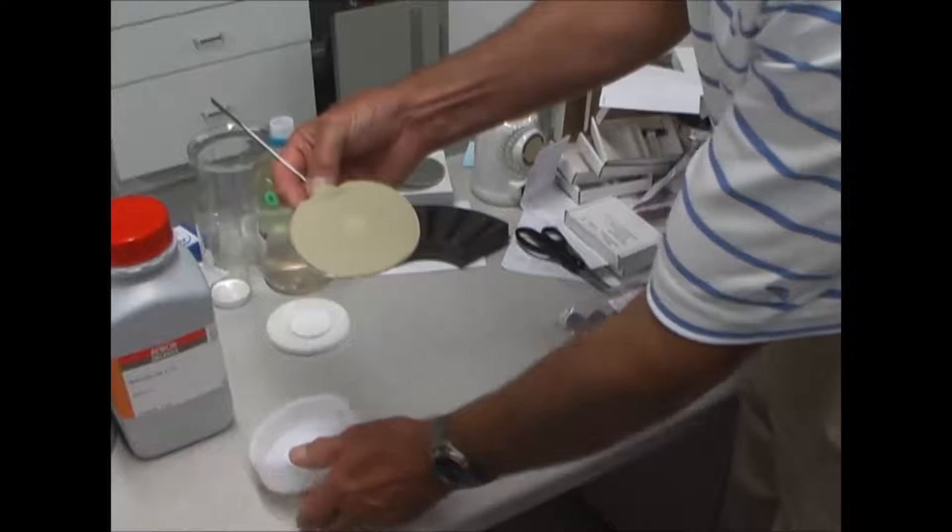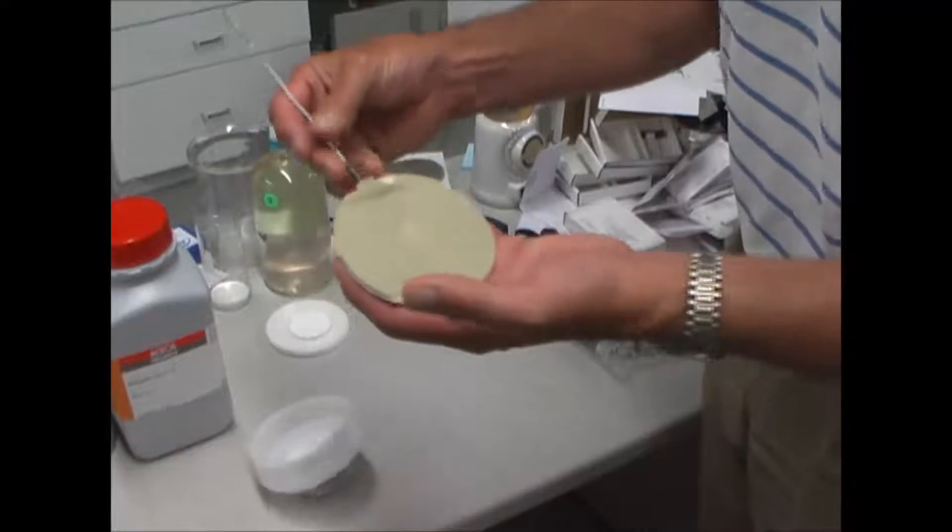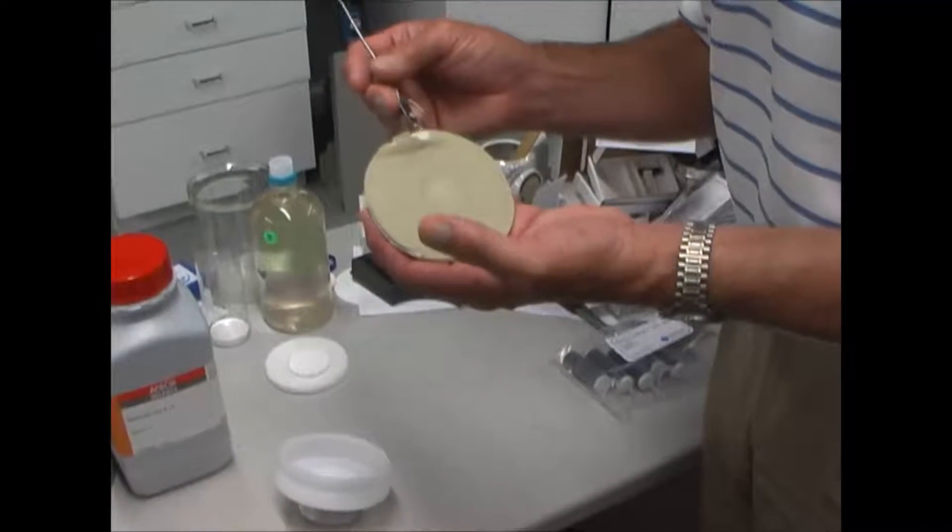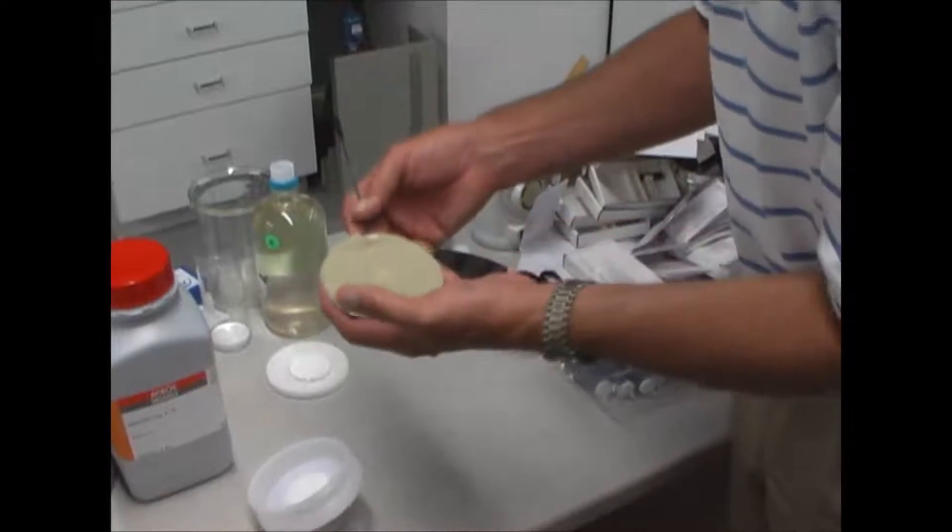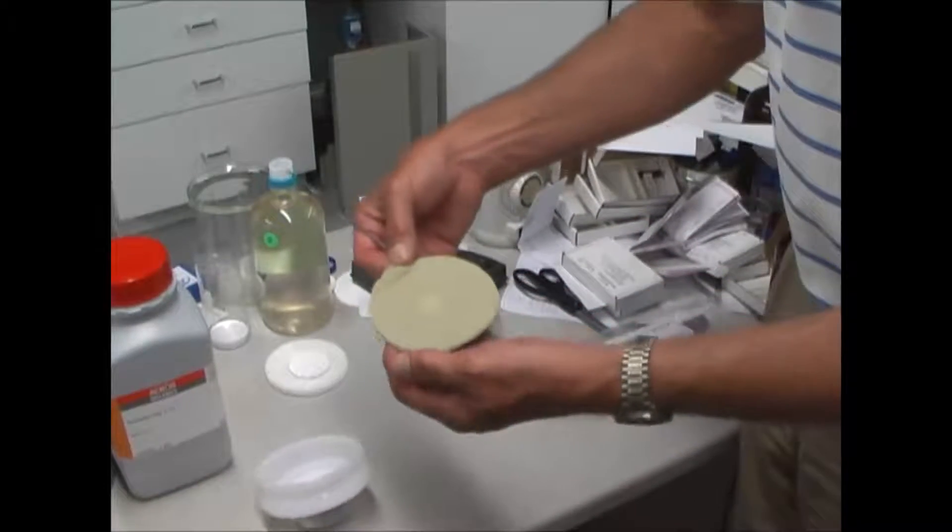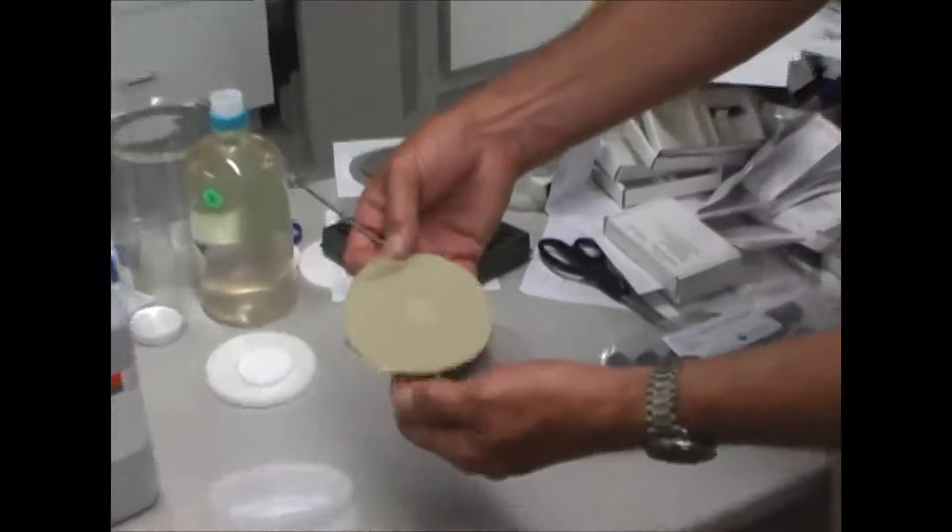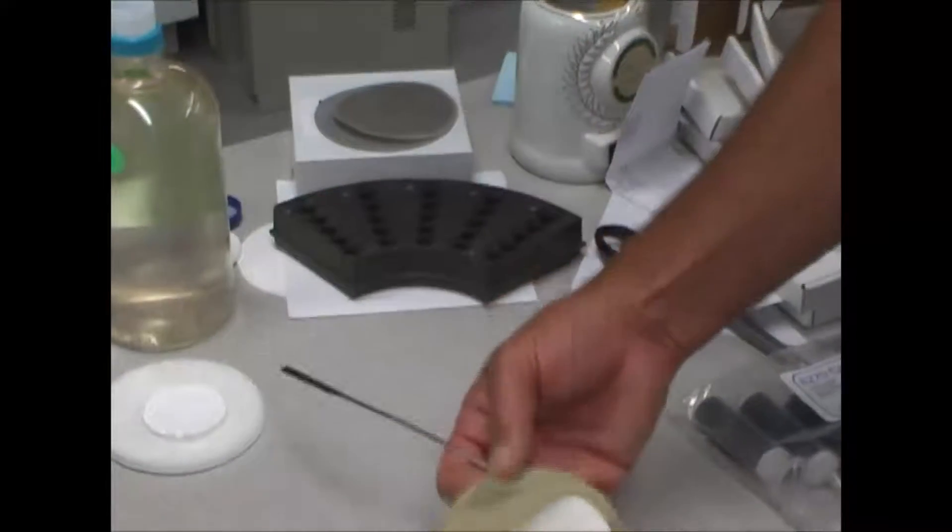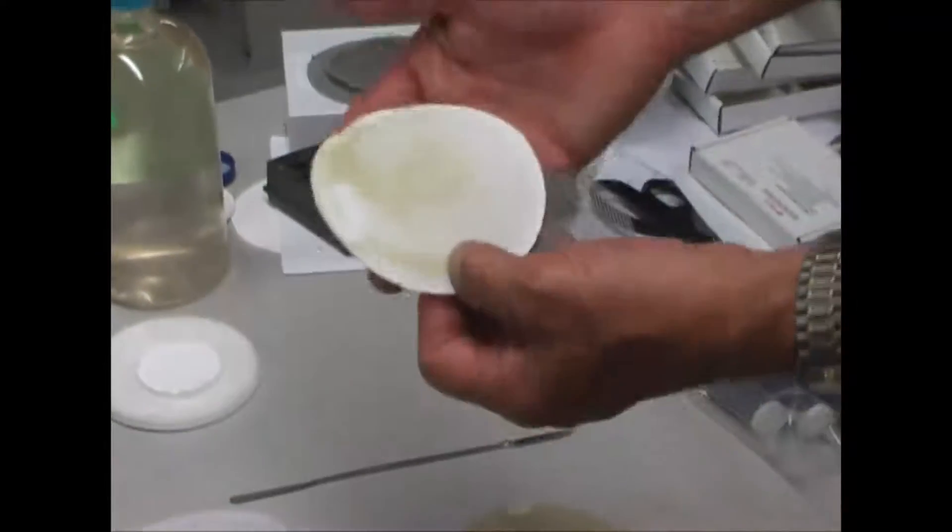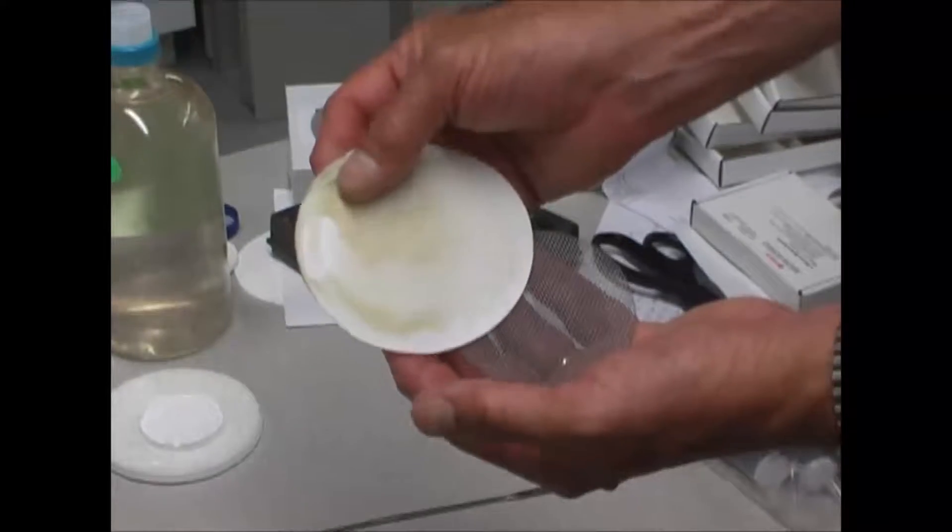So let's separate these pre-filters first. On the top is the five micron. We can see most of the clay held on that disc. The one micron underneath is fairly clean.